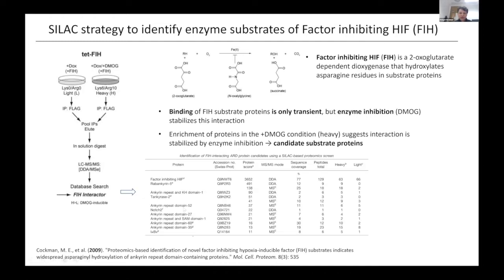And the outcome of that experiment is shown here, where we now have a set of proteins which are enriched in the heavy condition, and which are only seen at much lower levels in the light condition. So any of these are now candidate protein substrates of FIH.